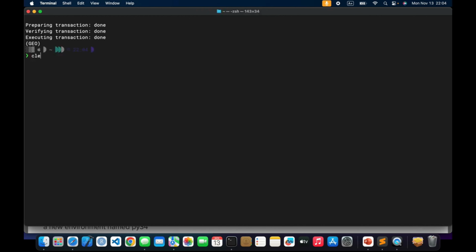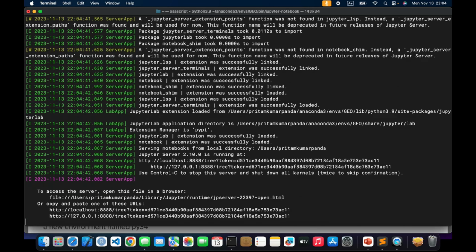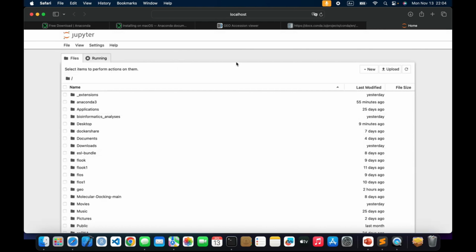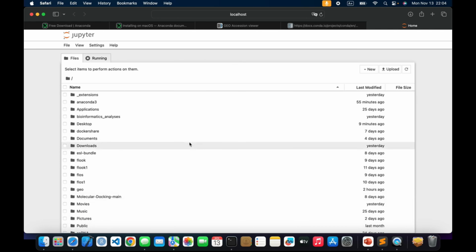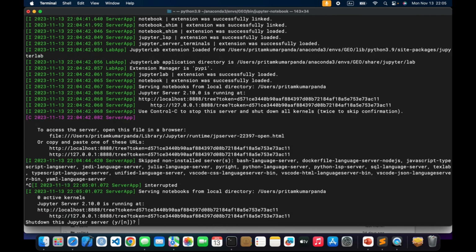Okay, now it's done. You can see that Jupyter Notebook has now been installed in your environment, and it will be invoked. You see, now it's there. Your Jupyter environment is invoked from here. So this is how you maintain an Anaconda environment. Let me just shut it down.